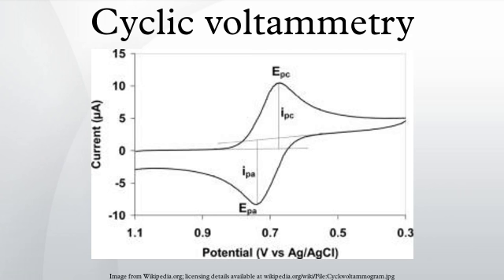This makes it a very good candidate for the determination of antioxidant capacity since it encounters oxidation species like ultraviolet radiation and ozone regularly. Other methods like mass spectroscopy and electron spin resonance can be used to observe oxidative stress, but they are expensive and time-consuming since tissue biopsies are usually required. Once the cyclic voltammetry is performed and followed by HPLC, results show that the skin contains the following antioxidant species, ascorbic acid and uric acid. Thus, cyclic voltammetry shows high success rate in quickly yet precisely determining the antioxidant species present on the skin.